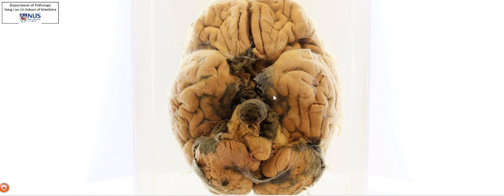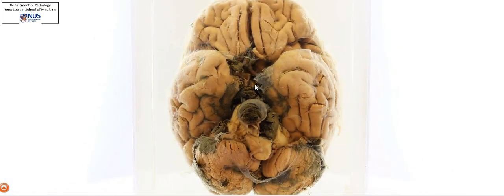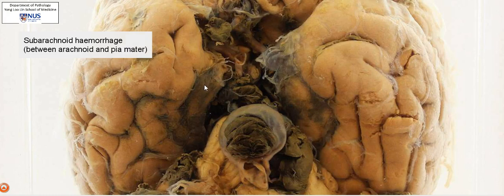There is an obvious area of blackish discoloration here. The surface we're looking at is the arachnoid mater overlying the pia mater, and the main pathology really is viewable on this surface. We see these blackish areas — what this is are areas of hemorrhage within the subarachnoid space, still below the arachnoid mater and just overlying the pia mater.